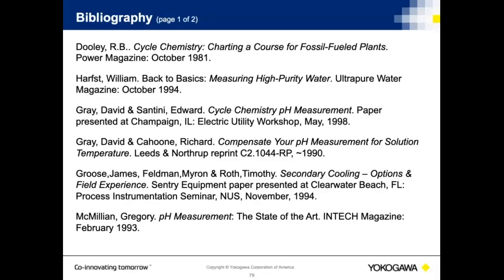When you're using a standard glass electrode, which is the normal way of doing a high purity measurement, you have a lot of surface area associated with it. My point is this, the FET typically is not going to last in harsh environments and will not do a good job in your high purity measurements.